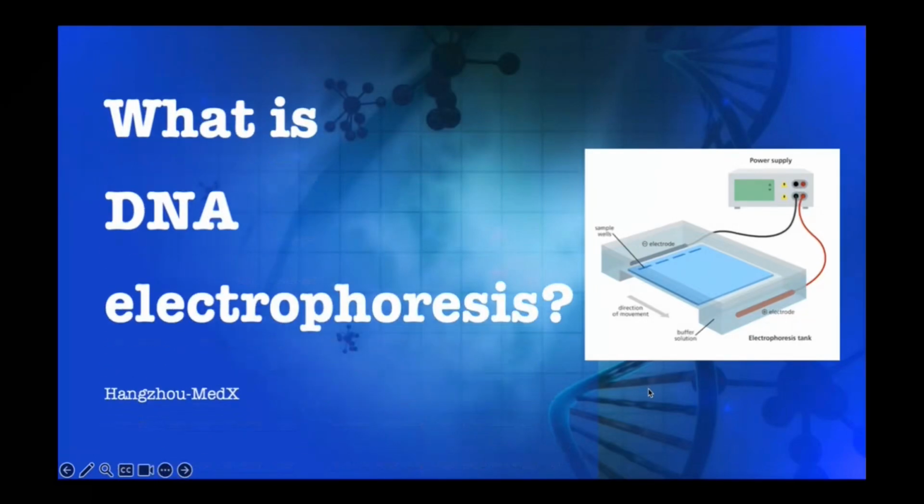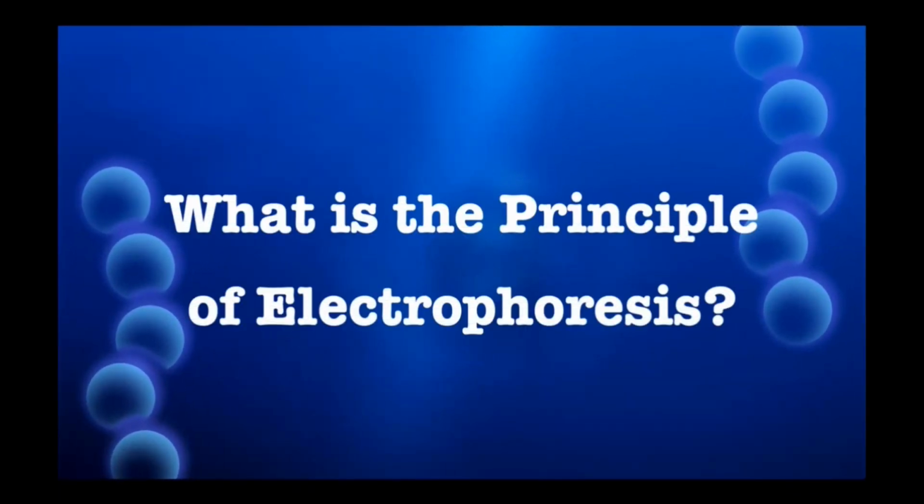Hi everyone, this is Annie from Hangzhou-MedX, and today let's explore some fun facts about DNA electrophoresis, what its principles are, and also the procedures of DNA electrophoresis in biological laboratories. So first of all, what is the principle of electrophoresis?